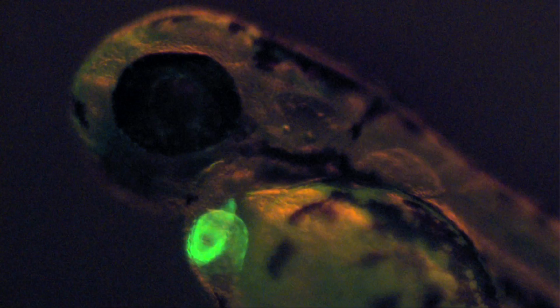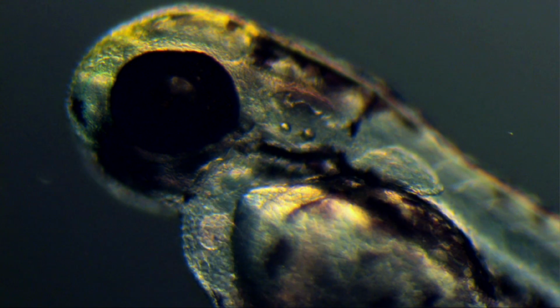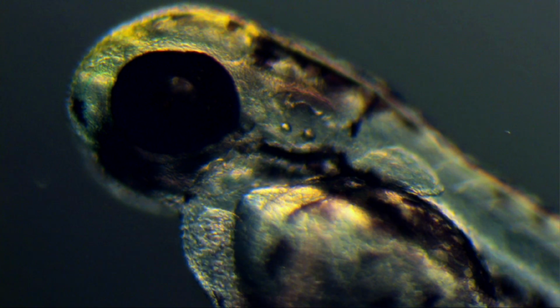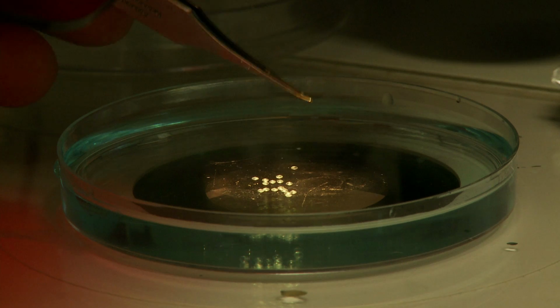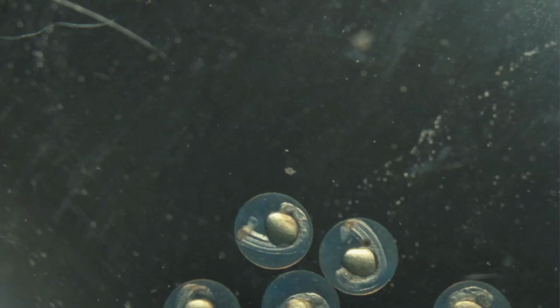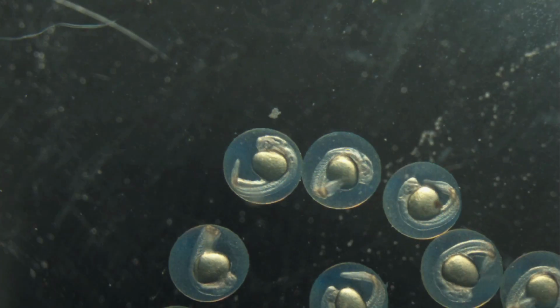So not only do we have our own microscopes, but we make extensive use of the confocal microscopy and advanced microscopy that's available through the Bosch Institute, and we also make many of our fluorophores and constructs using the Bosch molecular biology facility. A typical day in the lab would involve collecting eggs and injecting those eggs with our constructs to make them express the proteins and genes we're interested in.